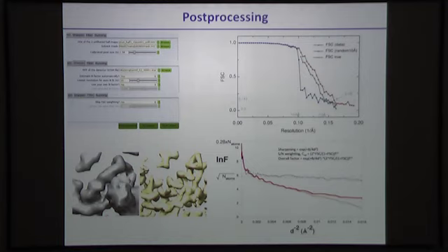And because you're using a mask, you have some artifacts due to convolution from strong low frequency components that creep into high resolution components. And RELION has implemented this phase randomization protocol to get rid of or fix mostly these problems with the masking effect, especially when you use a very tight mask.